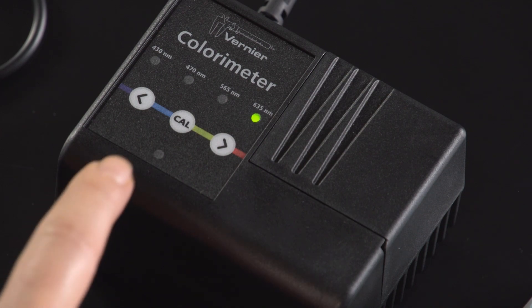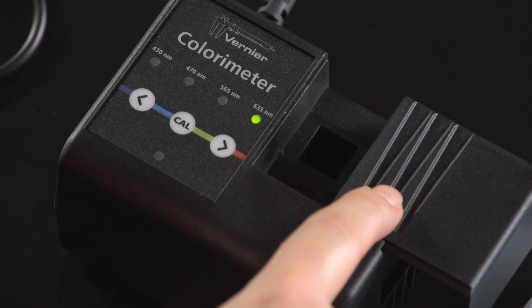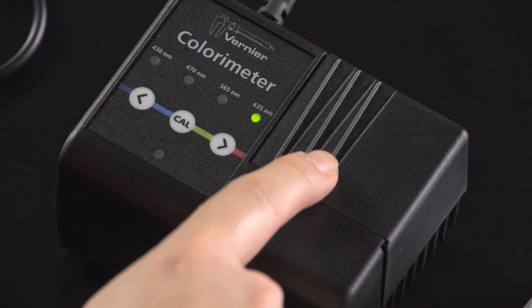The CAL is the calibration button. The cuvette slot is located underneath the sliding cover. Make sure the cover is closed before taking readings, and the light needs to travel through the clear sides of the cuvette.